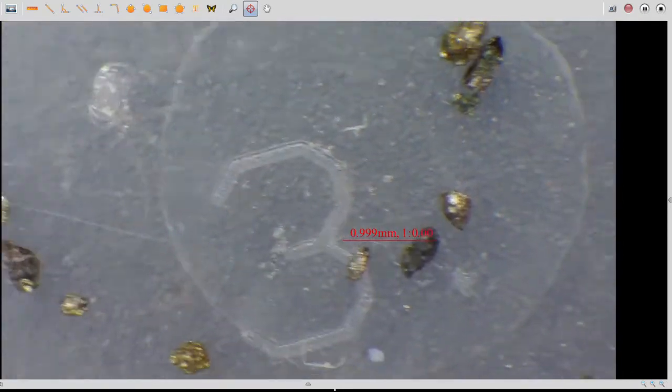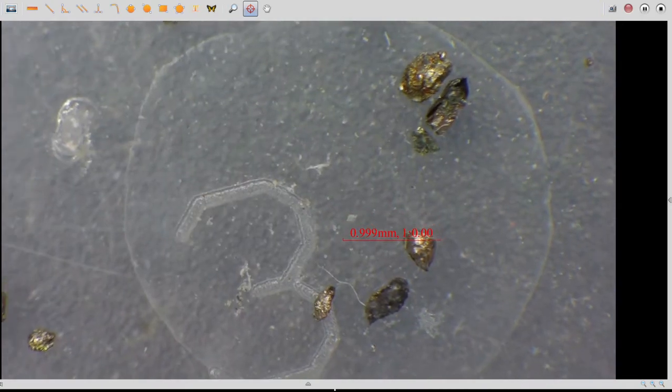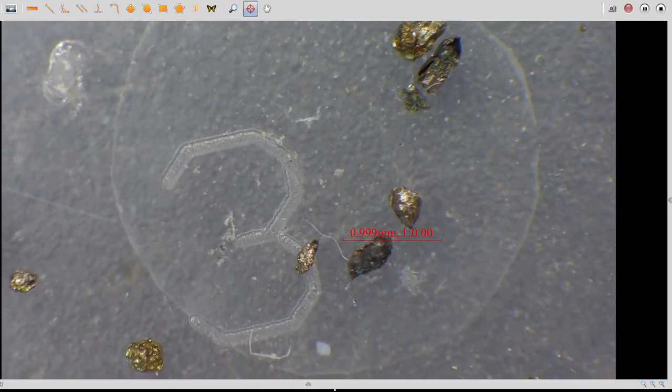This is a fraction. As we use a scale, we can measure each grain, its sizes, and also we can describe the morphology of grains. And also, as I mentioned, we make a special list of minerals we observed and use it in the next level of our studies.